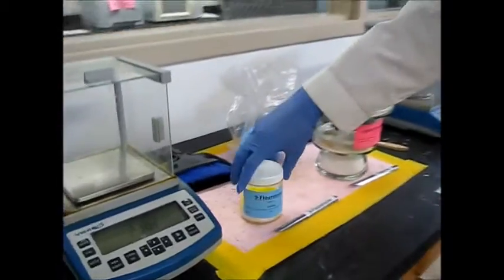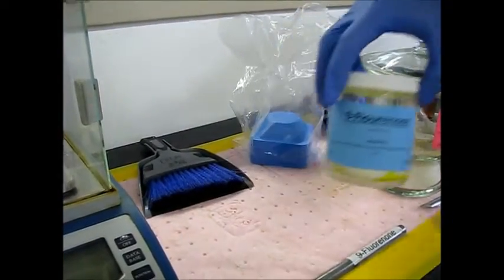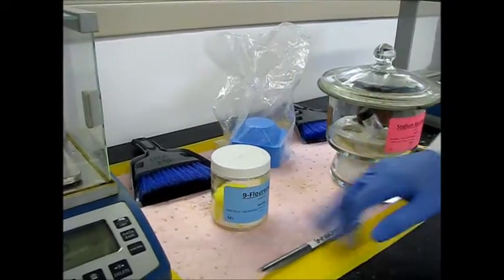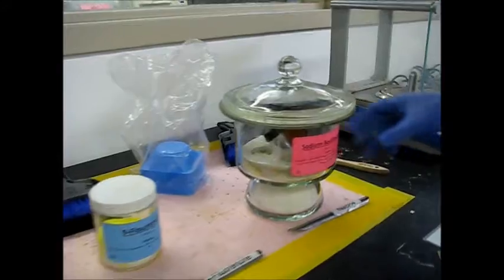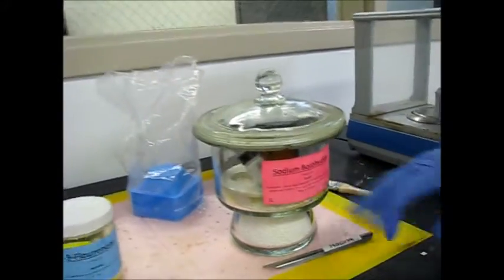So these are both of our solid reagents that we're going to be using for this lab. We have 9-fluorenone. Notice the yellow color, like I said earlier. It does have this blue label because we have all of our hazards color-coded. So blue means health hazard. And for sodium borohydride, pink or red means it's flammable.